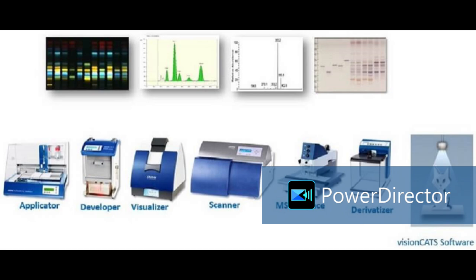We have all privileges to do complete R&D, including different sample preparation methods. We have only one limitation, biological sample handling. We don't have that facility here, so we are facing that small limitation. But we are fulfilling that need by visiting on-site labs like RFSLs and SFSLs. We are continuously in touch with them, taking reports from them, and observing how they do sample preparation and how the workflow goes on in their lab.